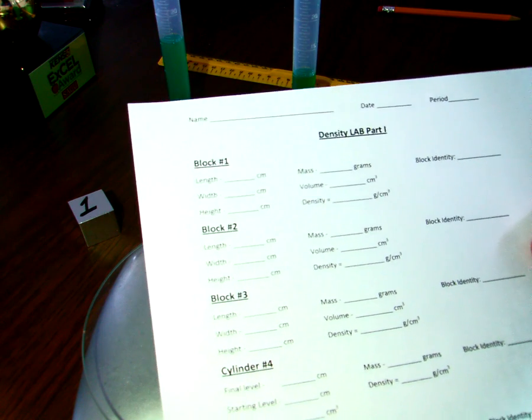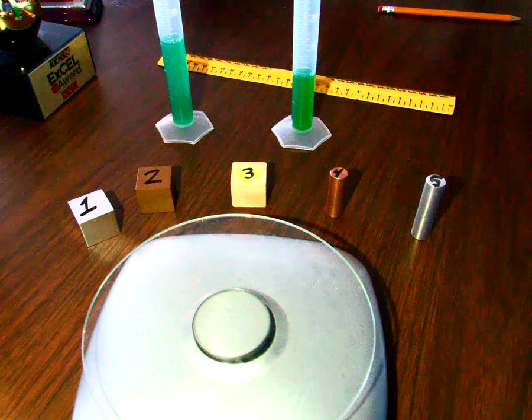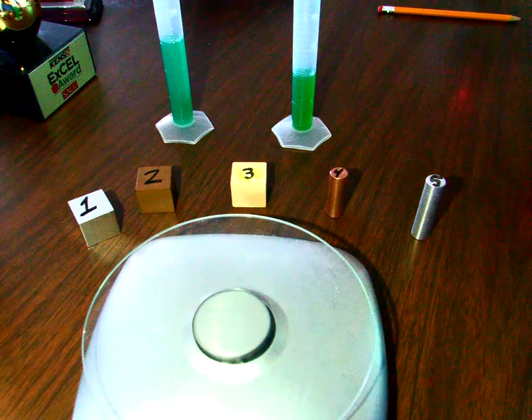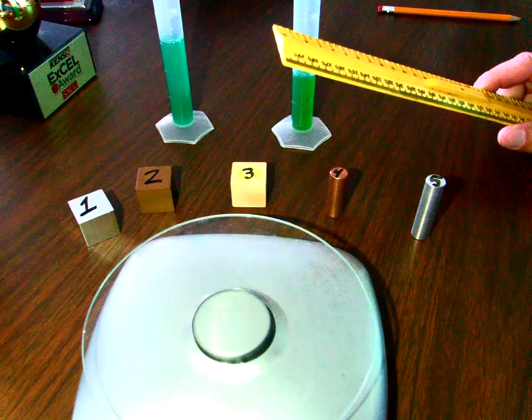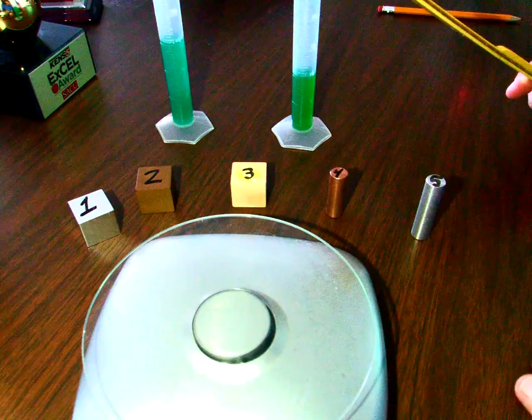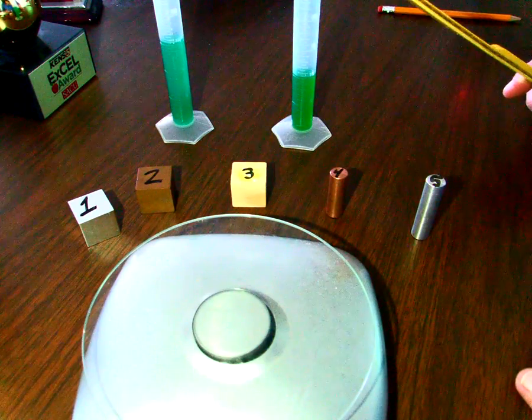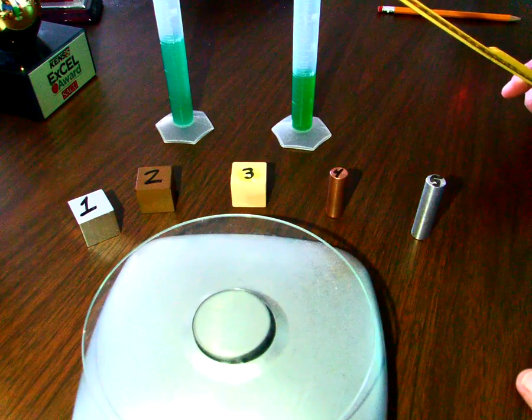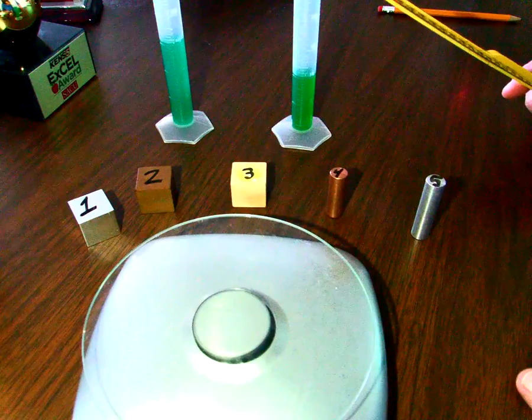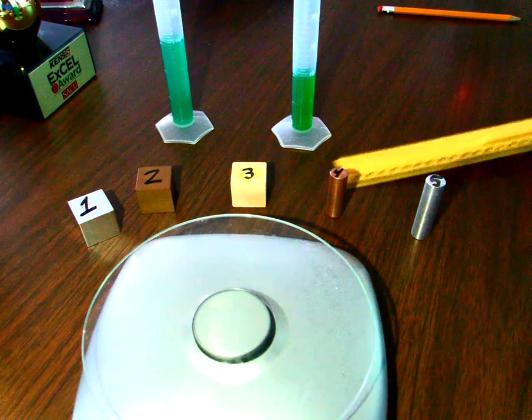So we'll go ahead and get started. We're going to be working with block number 1 first, and how this is going to work is I'm going to show you the dimensions of the block using this ruler, and then you are going to calculate your volume. After you find your volume, I'm going to mass each of the blocks using our scale here, and then you'll have your volume and your mass, and you can go ahead and calculate your density. We'll go slowly, and that way you can have time to calculate volume and find your mass and then find your density, and hopefully you can identify your unknown metals. So let's go ahead and get started with block number 1.